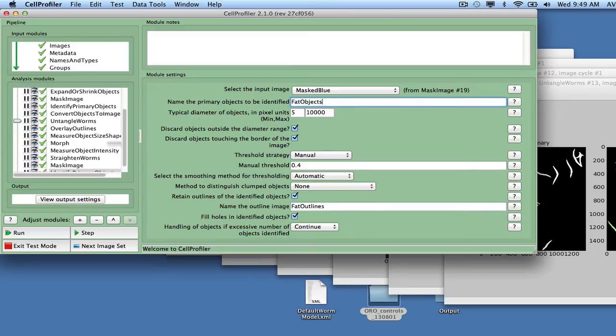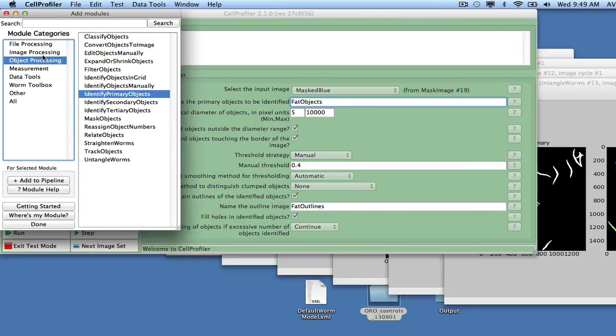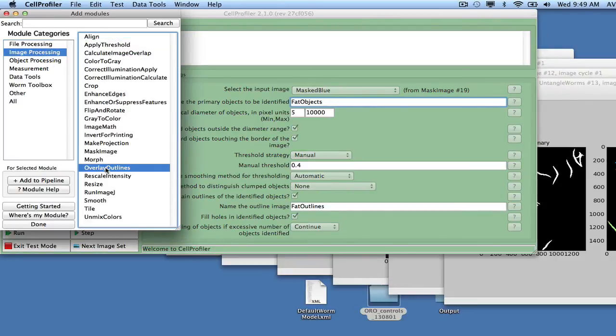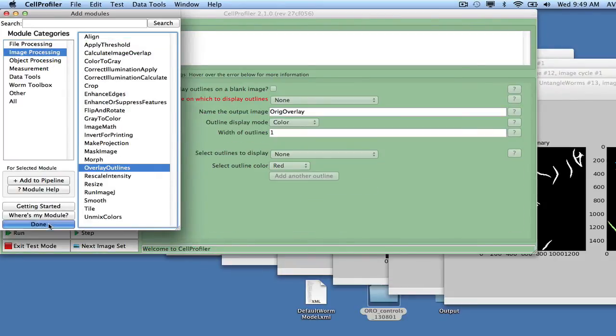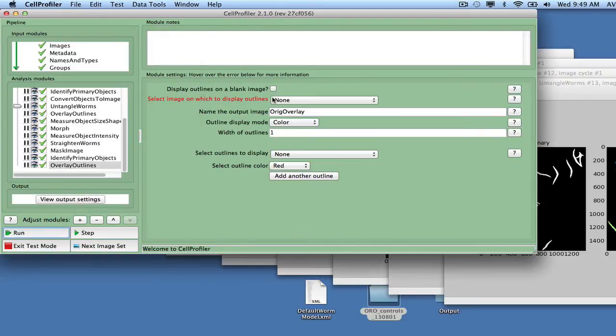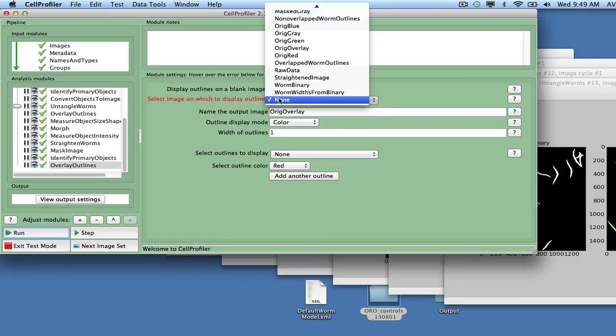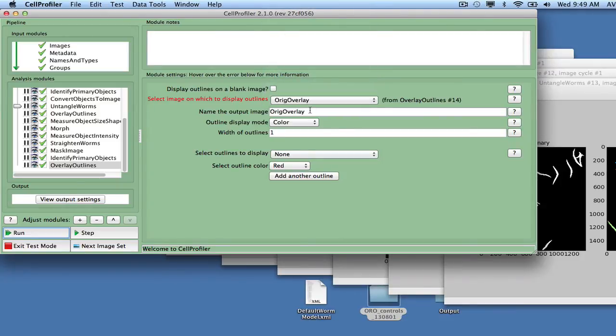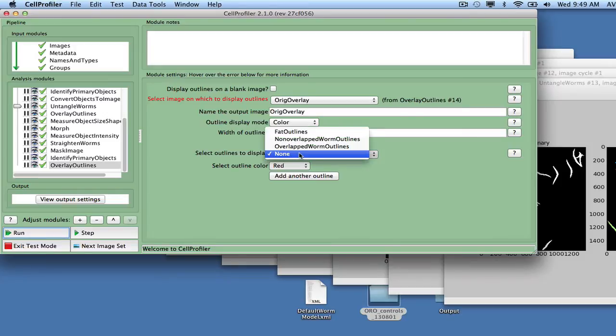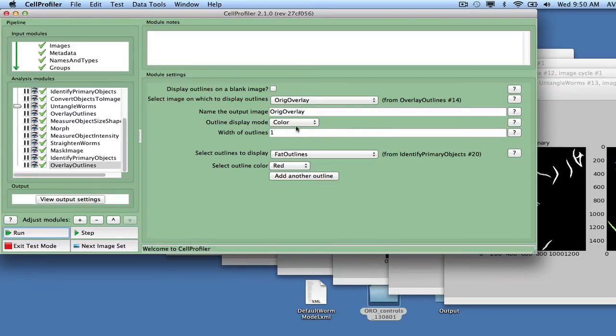To be able to see the detected fat outlines, we will use the Overlay Outlines module to add them to the image in which we already outlined the worms, namely Ridge Overlay. We do this by adding the module Overlay Outlines and selecting Ridge Overlay as the image on which to display the outlines, selecting fat outlines for the outlines, and calling the output image Ridge Overlay with fat.